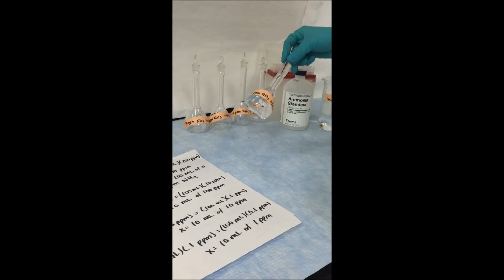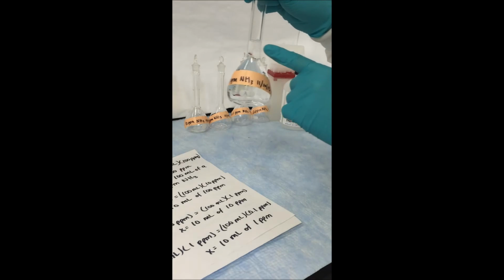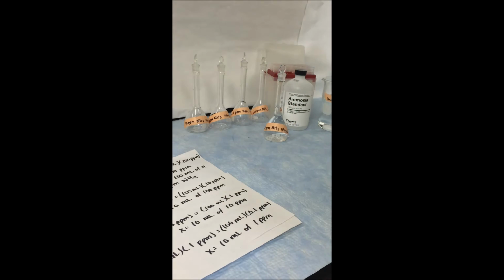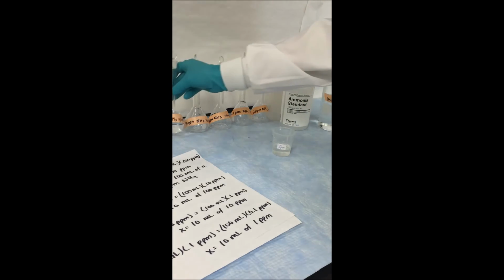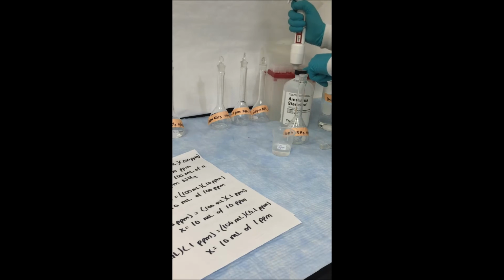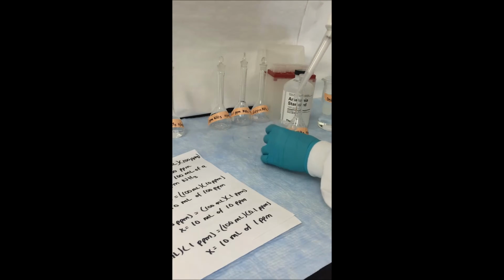Using this 100 part per million solution, we are then going to make our 10 part per million serial dilution. Again, using a fresh, clean beaker, we're going to go ahead and pour out a small volume of the 100 part per million solution so we don't contaminate our batch. You want to make sure as you're making your serial dilutions that you keep your technique consistent throughout.